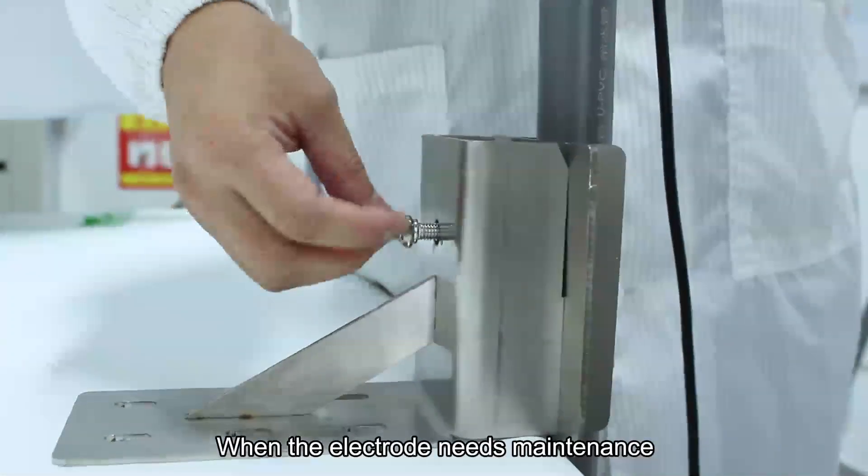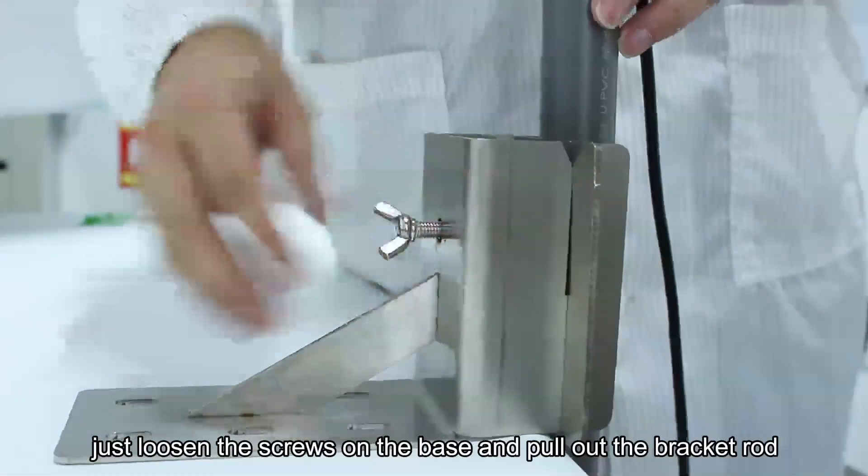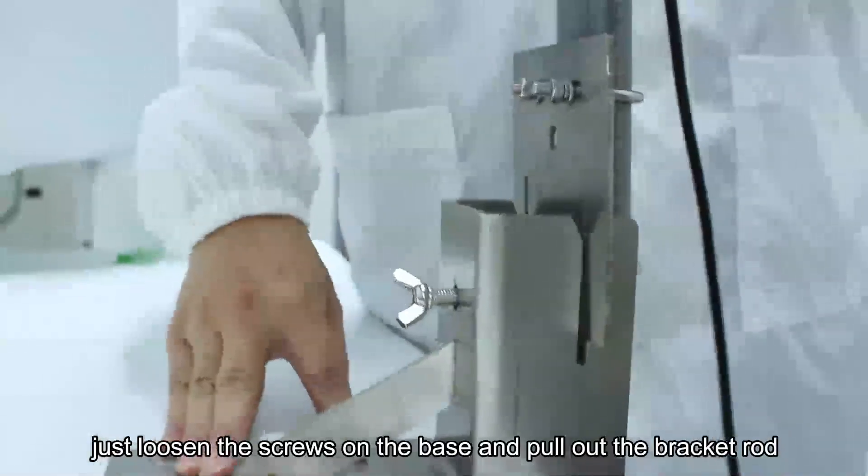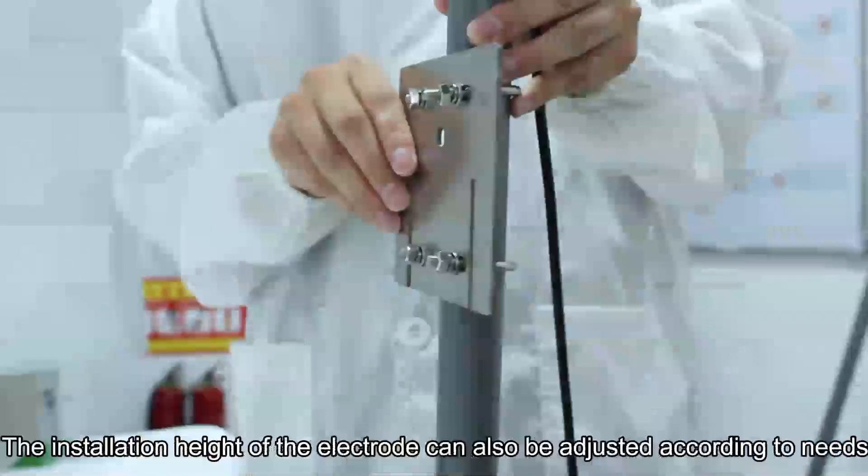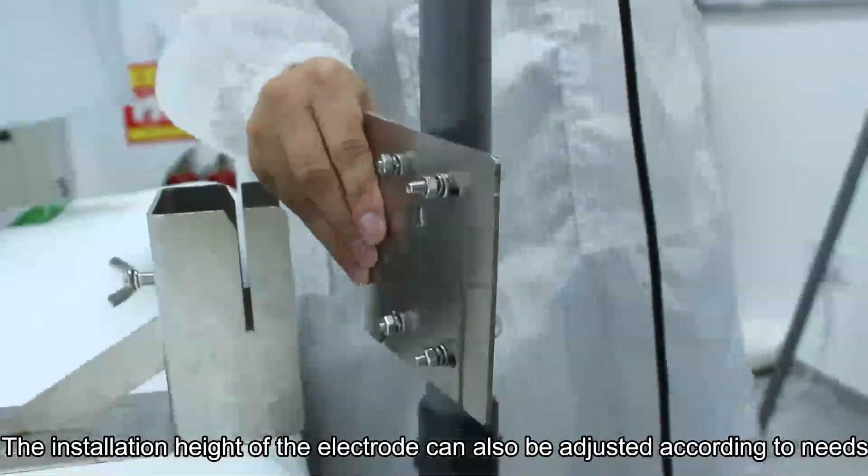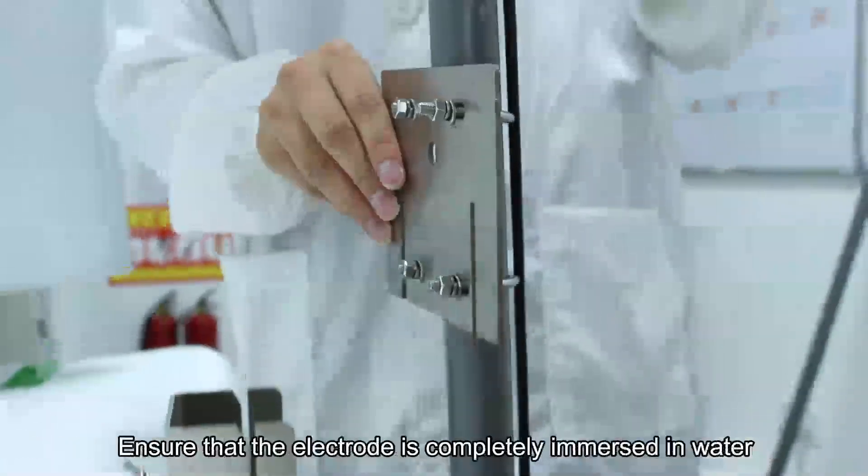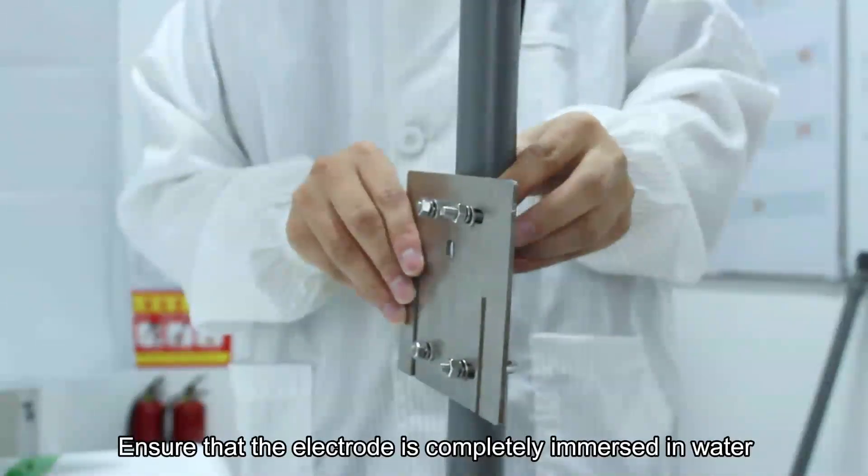When the electrode needs maintenance, just loosen the screws on the base and pull out the bracket rod. The installation height of the electrode can also be adjusted according to needs. Ensure that the electrode is completely immersed in water.